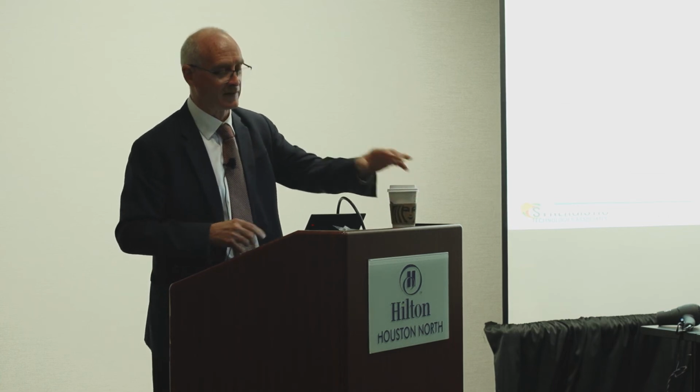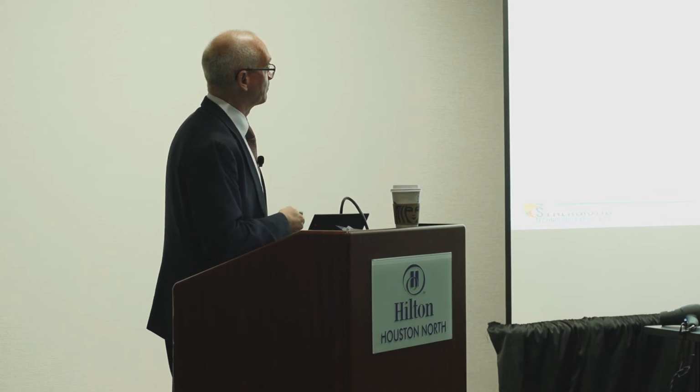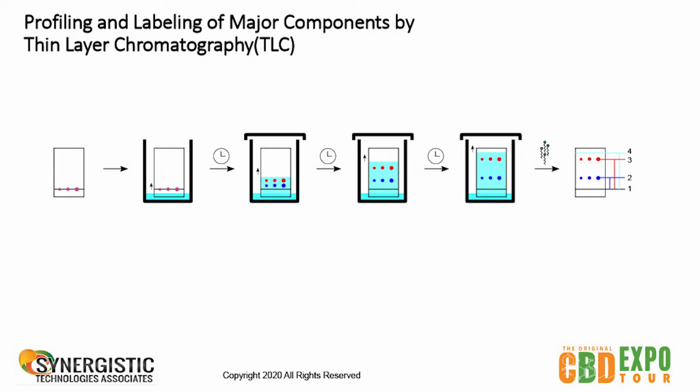It's just made on a different dimension, and you're using a different solvent and trying to separate different compounds. It's like paper chromatography, but this is thin layer, which happens to use a different backing. You start off with a piece of silica, you draw a line across, and you take a small amount of the material and make a droplet.